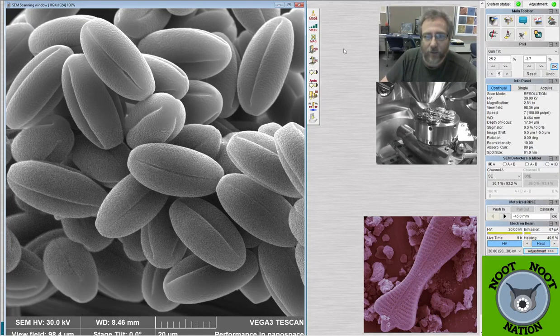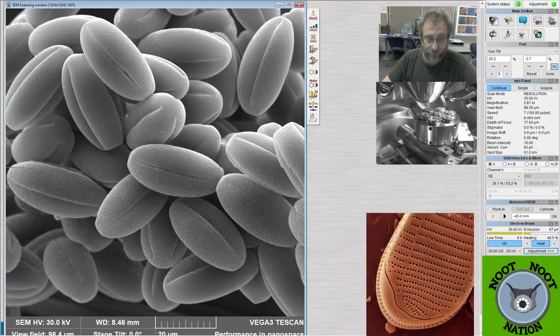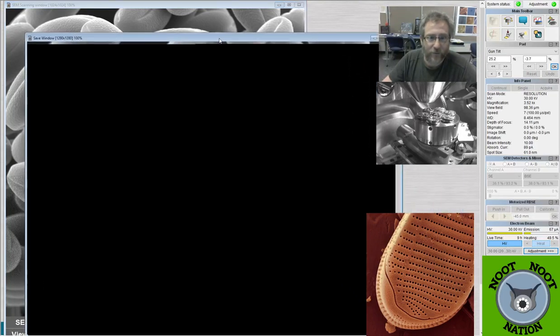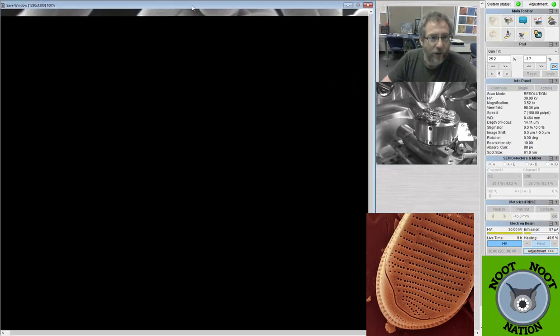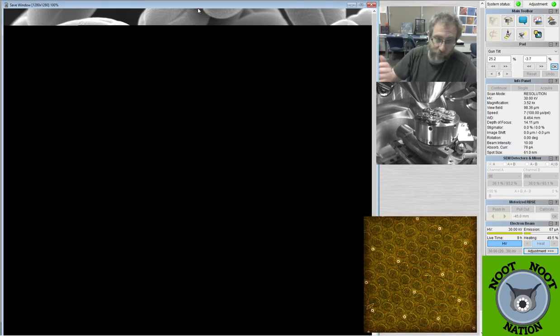So it's just a fun project I've been working on, collecting some different types of plants, and then throwing them in the SEM and photo documenting what we find with respect to the pollen associated with that plant. So it's not what I do for my normal scientific analyses. I'm actually a diatomist, but I run into pollen a lot, in particular looking at lake samples.